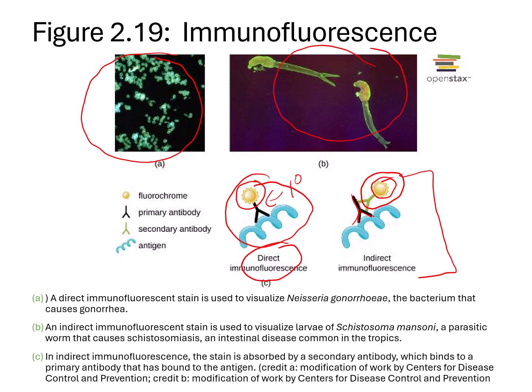And this allows for signal amplification, indirect immunofluorescence does, because you can have multiple secondary antibodies bound to the primary antibody. Our picture in the book doesn't show it, but you could have another one here and another one here. And if you have all three bound to the primary antibody, the signal would appear 3 times as intense as the single one over here on the left.